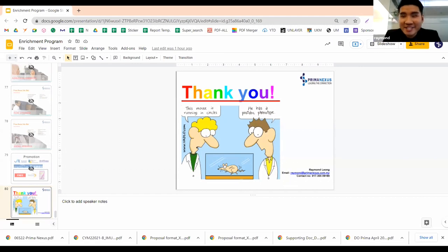From my understanding, gnawing material is not supposed to be eaten. So theoretically, it doesn't affect the food intake, because you are not taking the gnawing material as a food. The gnawing material is going to be very, very strong material where they do not consume it. But if you consider, for example, that they gnaw and then just satisfy their satiety with it, I don't think so. In my opinion, I do not think it will affect the food intake.